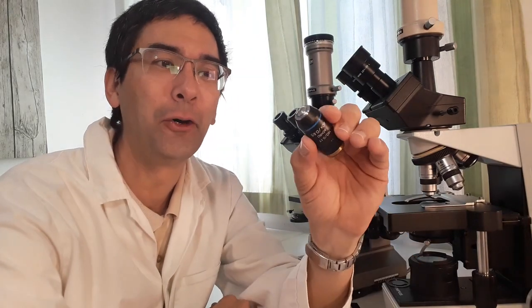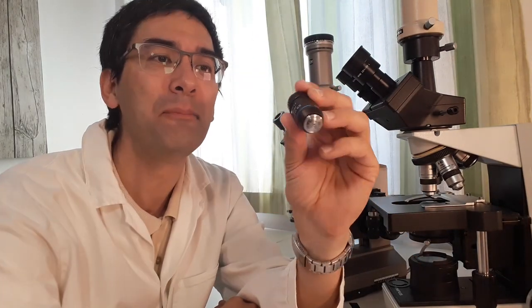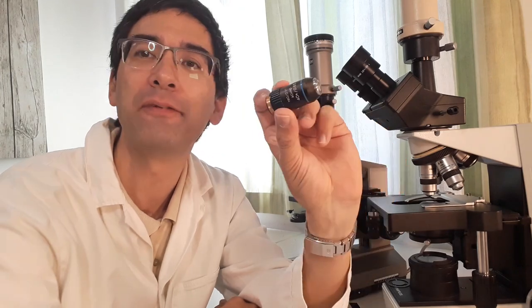Hi, Microbe Hunter here. I've got an old damaged 40x magnifying microscope objective and I want to take it apart because I want to know how many parts it's made of.